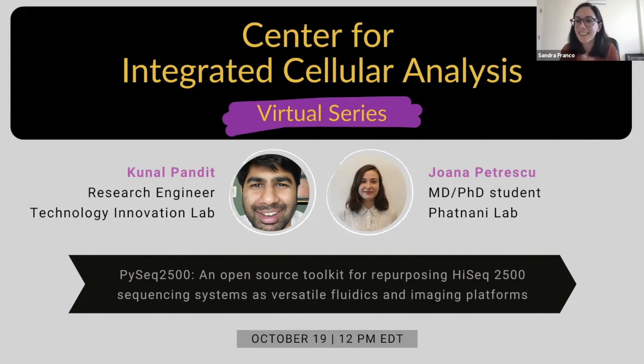Yeah. So we're adapting it for spatial multi-omics. We want to do proteome, transcriptome, and maybe some genotyping in tissues and in cells. We're specifically adapting SABR, immunoSABR and SABR RNA and DNA, because it's the same chemistry to measure all three modalities.